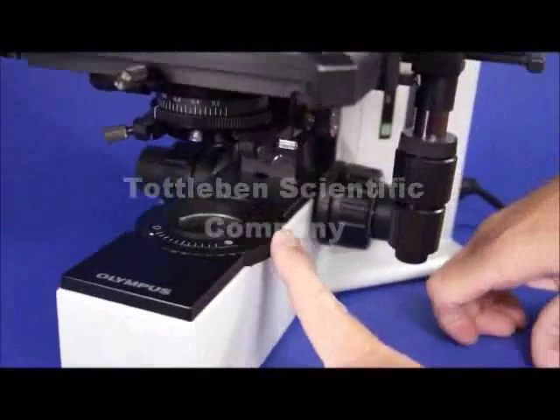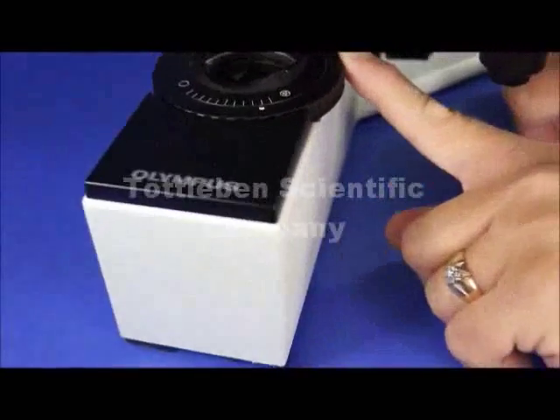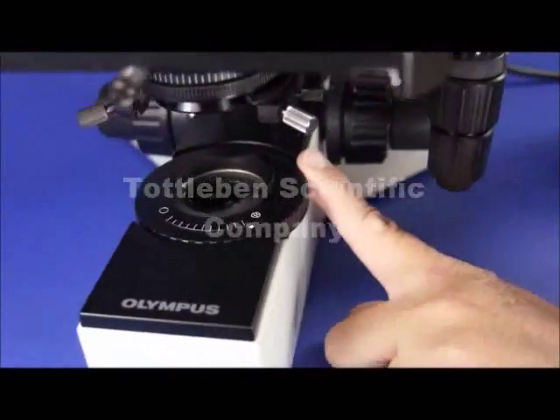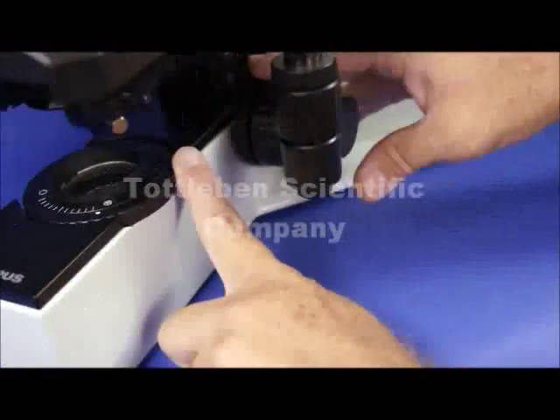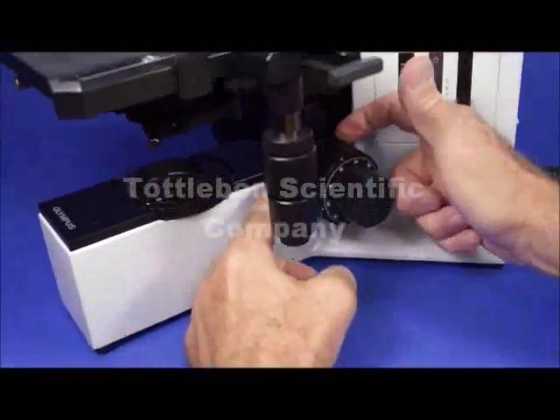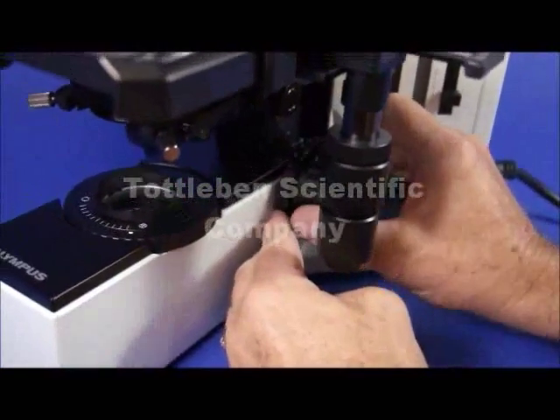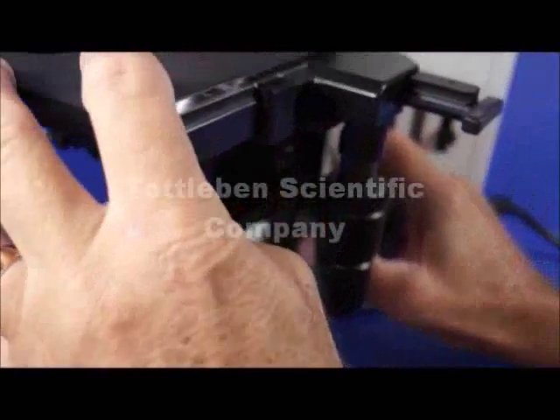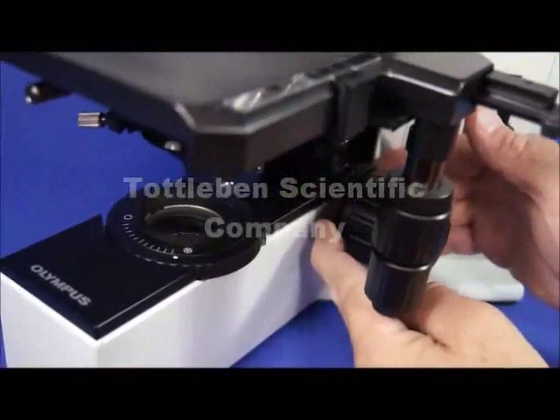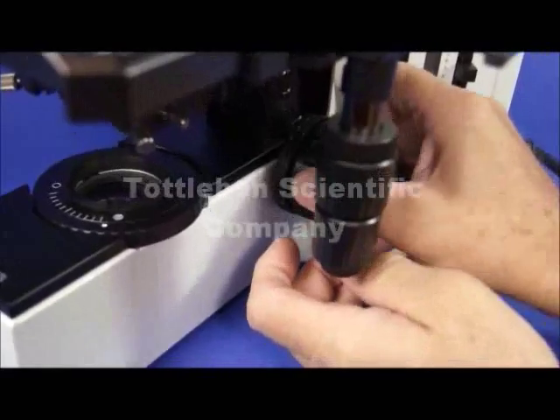Working our way down to the field stop, this field diaphragm makes this microscope very valuable in terms of centering it the way a professional would like to center it. Going over to the coaxial coarse focusing mechanism, you have coaxial coarse focus on both sides. On the inside, you have a tension adjustment so that after you've used this thing for several years and the stage becomes a little bit loose and might drift downwards, you can use this inside tension knob to add a little bit of tension on that gear.